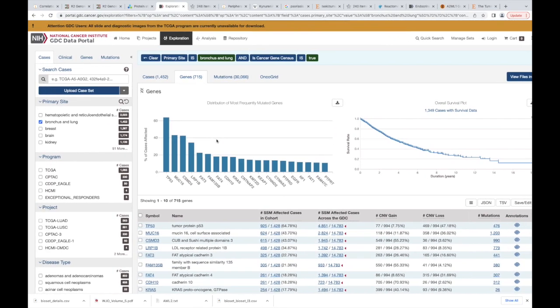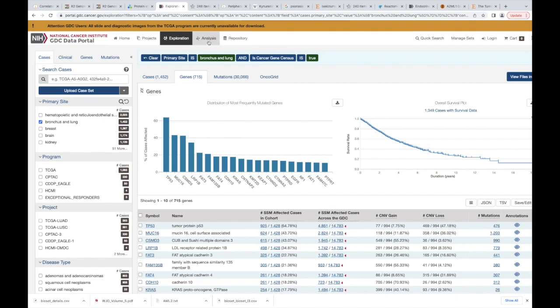I think TCGA, here's what will happen: somebody will say, 'Hey, find out how many mutations or what the frequency of this particular mutation is in this kind of cancer.' This is a great place to do it. Anything else? I don't know. I haven't... I really haven't. You can go to this analysis part, which is on the top here.